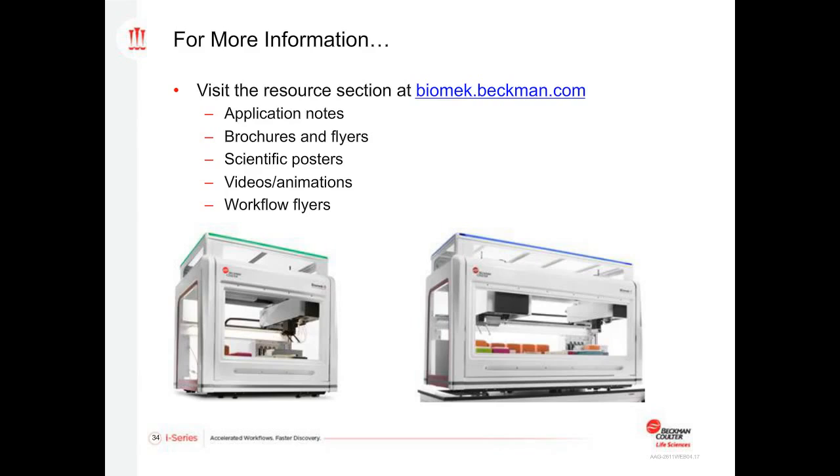How do you handle contamination? Yeah, this comes up a lot actually. In 7 years of doing this, I've only run into it once, and my way of dealing with it was to throw out the contaminated plate. I really didn't have any other problems.